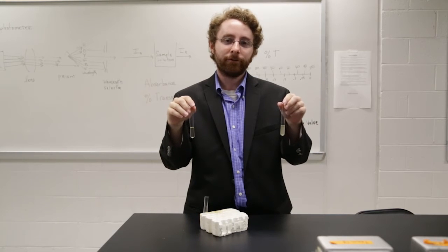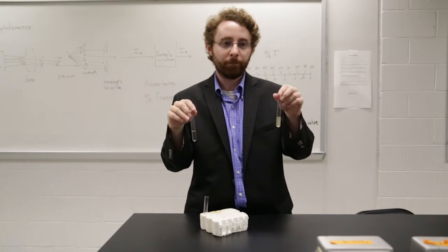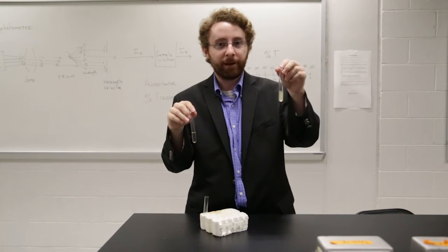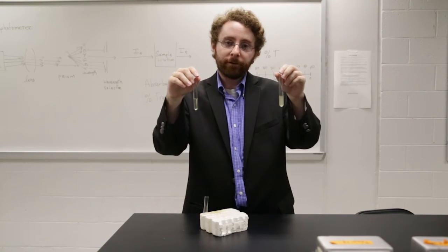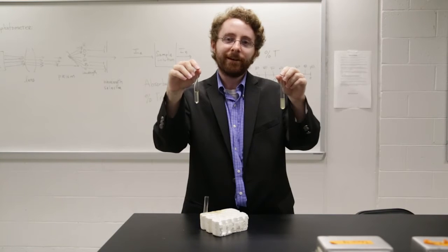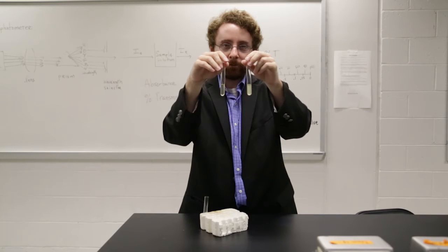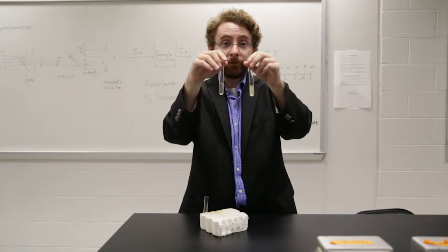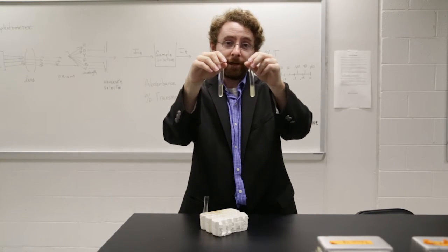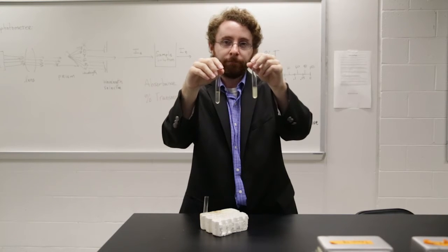So next, what I'd like to do is to show you how to use the spectrophotometer in measuring the absorbance of this sample of bacteria. As a comparison, I have this tube here that contains a solution that does not contain any bacteria. If you look at the two tubes, you will see that the blank or control is clear and therefore should have 0 absorbance, while the tube with bacteria is turbid and therefore should give us an absorbance value.